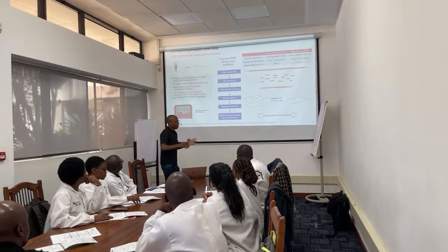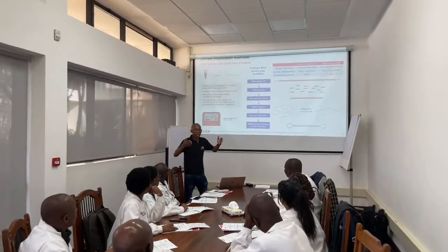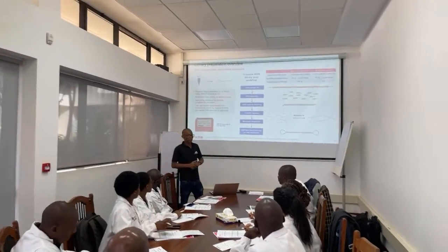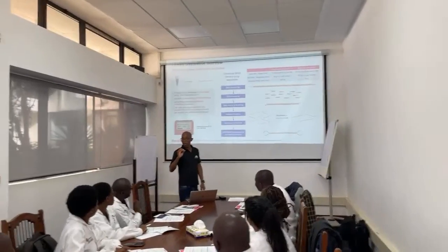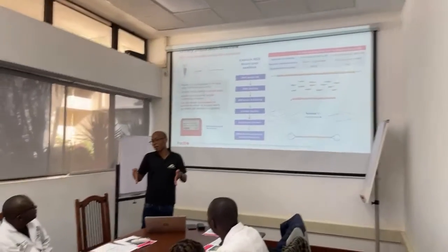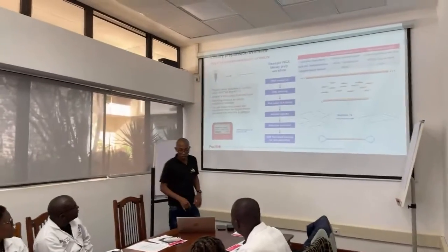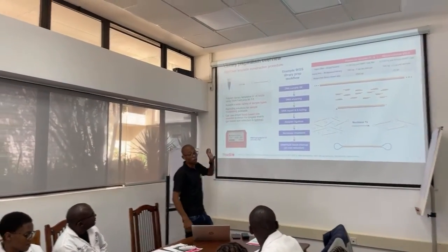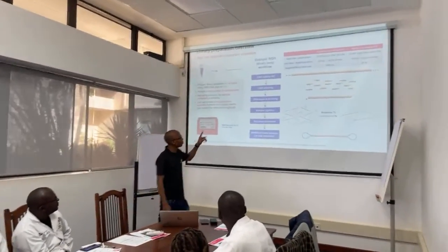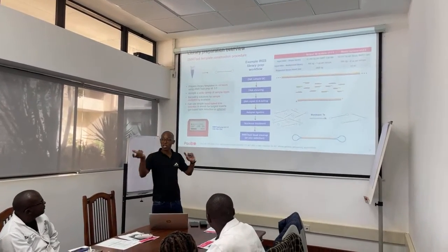End repair basically means that when you shear the DNA, you don't always generate blunt ends. You have sticky ends, with lengths all over the place, right? And then the end repair basically fills those gaps or cuts to create blunt ends. Once you have nice blunt ends, as you can see there, we do what we call the A-tailing. We just ligate an A base to the molecules, to the opposite side of the molecules.